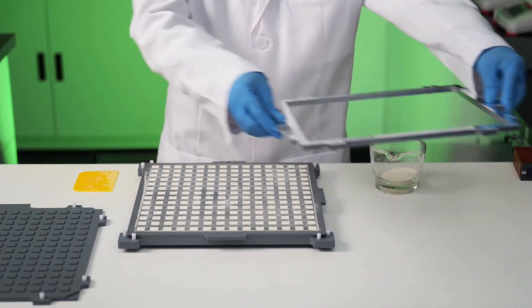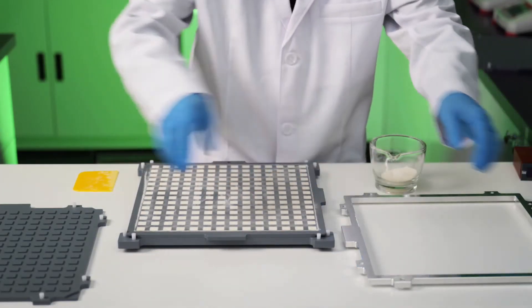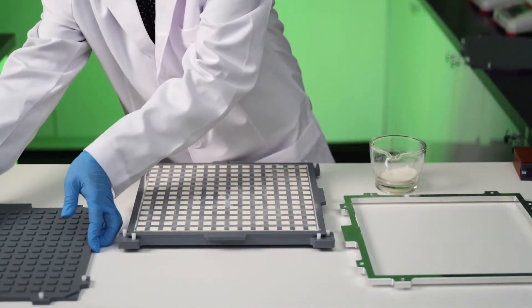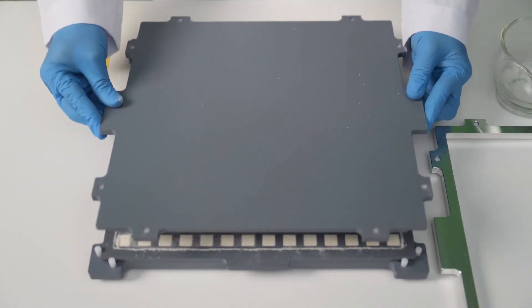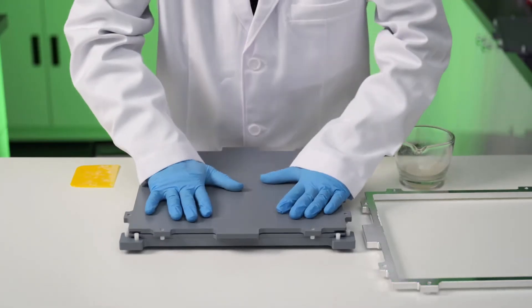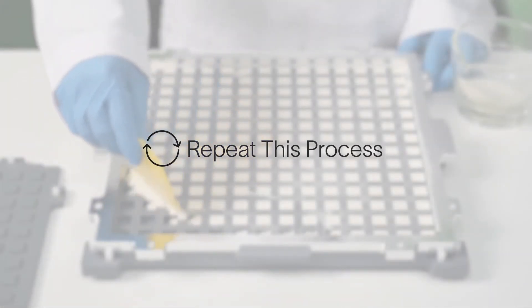Once the cavities cannot be filled any further, it's time to tamp the powder. Simply align the tamper over the cavity plate and press firmly down, condensing the powder into the mold. Repeat this process of spreading and tamping the powder until the cavities are full.